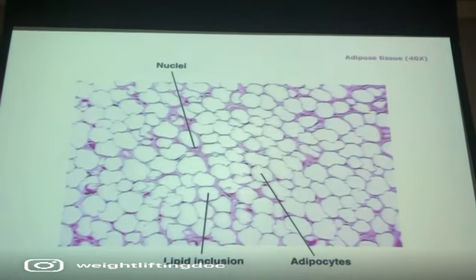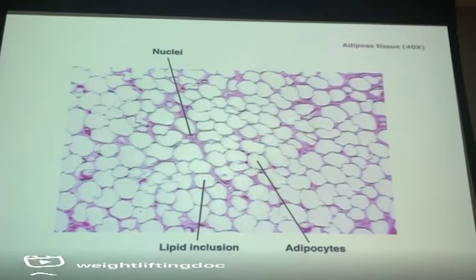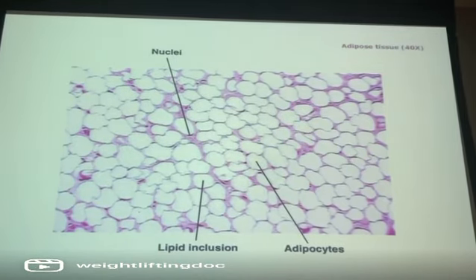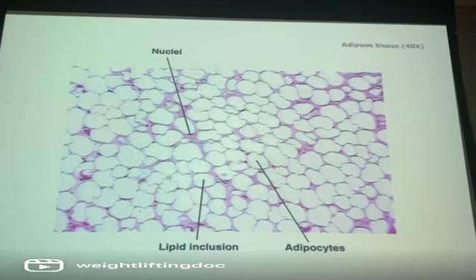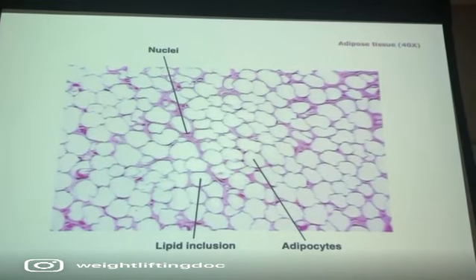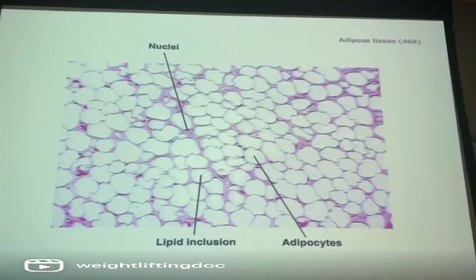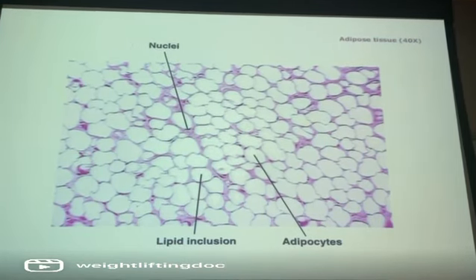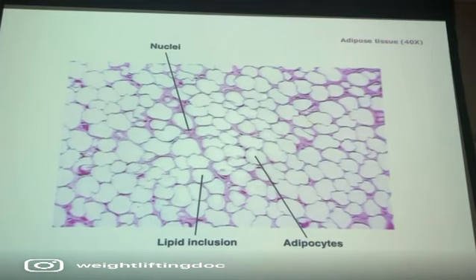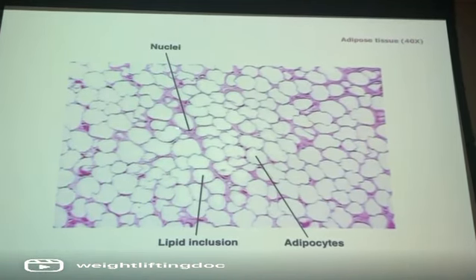This is adipose tissue. Now if you look, and we differentiate this from simple squamous, right? These look to me like fish eggs or something along those lines, and the nuclei are not anywhere in the center, right? So if you look at that simple squamous looking for that SI view, we don't see the nuclei in the center on this one where we do in simple squamous. See that on the sides there? And also there's some spacing in there, which we did not see with simple squamous.